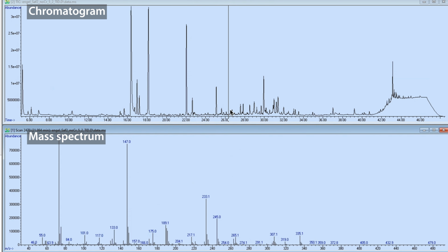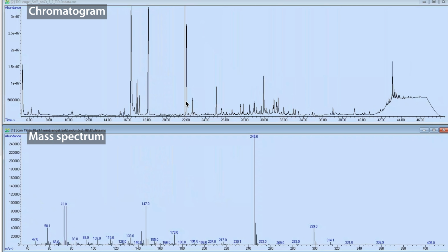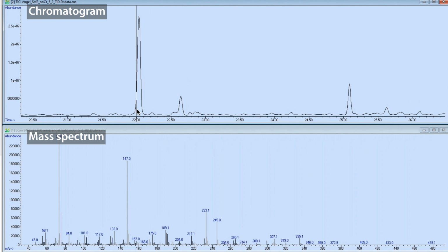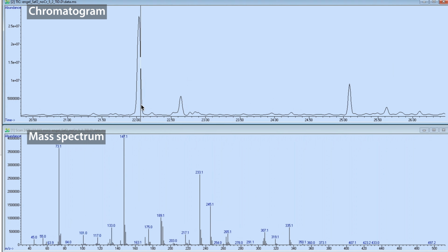There are often going to be a lot of different potential matches, and a lot of molecules have similar fragmentation patterns and similar M/Z. Hopefully, though, they won't travel the same on the gas chromatography part. So you take advantage of the fact that the gas chromatography not only separates these, so that we don't have the spectra overlapping as much. As you go through a peak, in a really small amount of time, the signal changes a little, the abundance of each of the different peaks, because there's not as much other stuff coming out, or there's new stuff coming out.